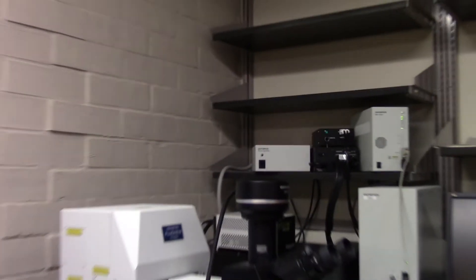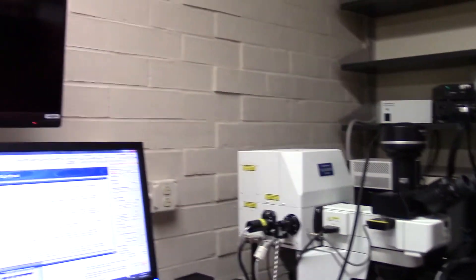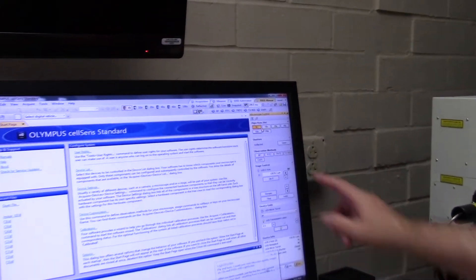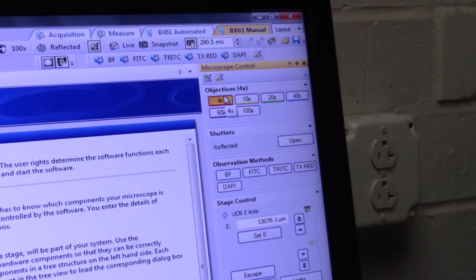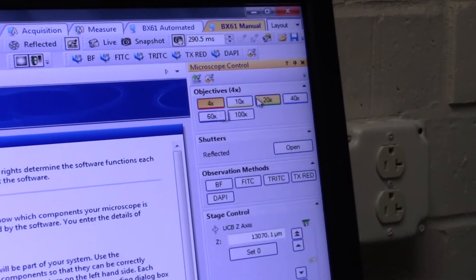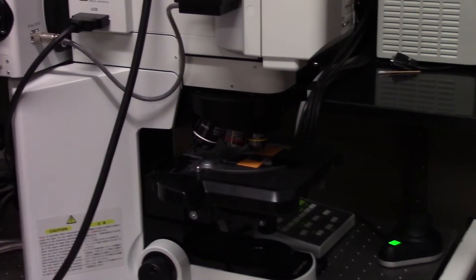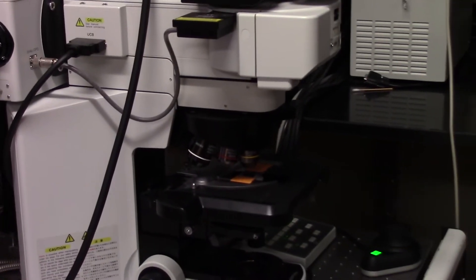Let me show you what some of the things are that the computer can control. For example, let's say I wanted to change the objective lenses. So right now I'm at 4x, let's go up to 10x. Watch what it does. Notice I am touching nothing — the computer does all of that through the universal control box.